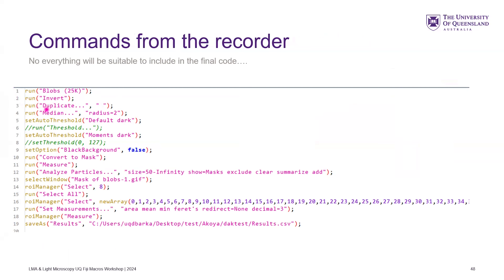There's this example image — duplicate it, blur it, run the threshold of Moments, then convert the mask, analyze the particles, dropping them into the ROI manager so I add the ROI. Then go back and select the original image, isolate one of the ROIs, then go back to all of them, turn on a number of measurements, actually measure it, and save the results table. So that's all the commands basically for that little workflow.